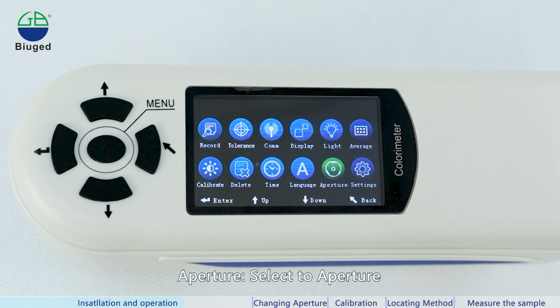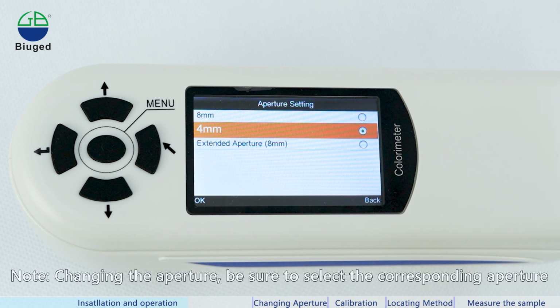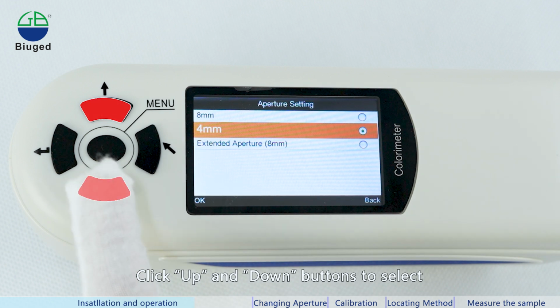Aperture, select Aperture. Click the Enter button to enter the aperture interface. Note, when changing the aperture, be sure to select the corresponding aperture. Otherwise it will lead to inaccuracy of the measured data. Click the up and down buttons to select.